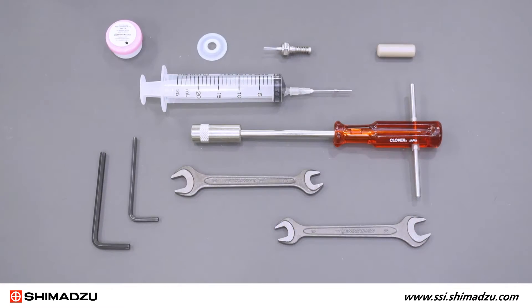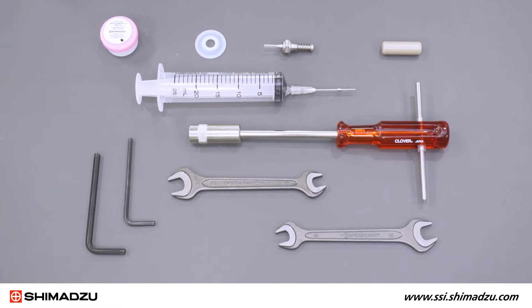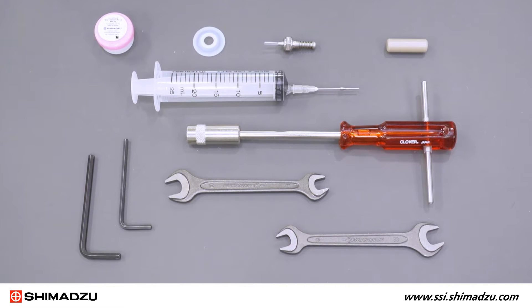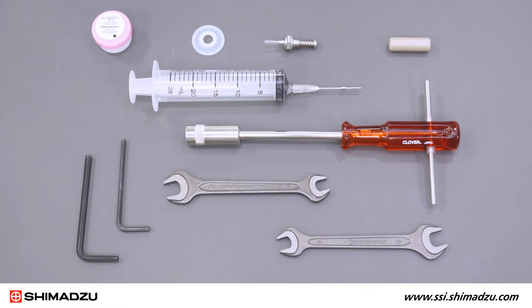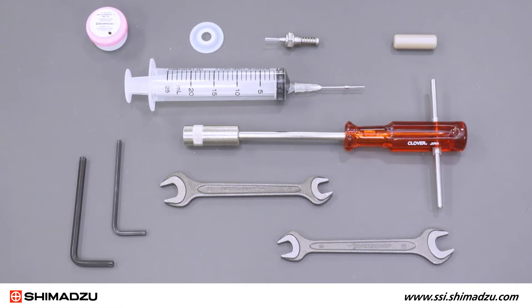You will need a plunger assembly supplied with a diaphragm and grease, a diaphragm jig, a syringe, an M4 Allen wrench, an M5 Allen wrench, a box driver, an 8mm wrench, and a 10mm wrench.